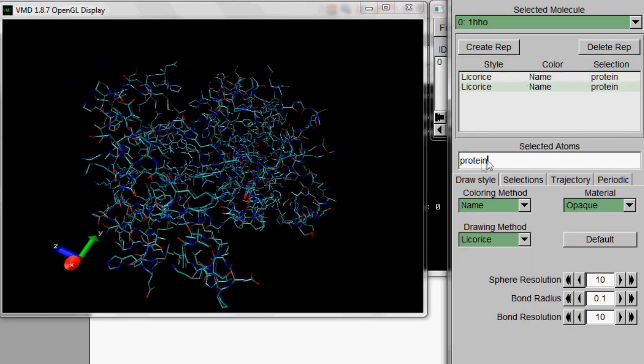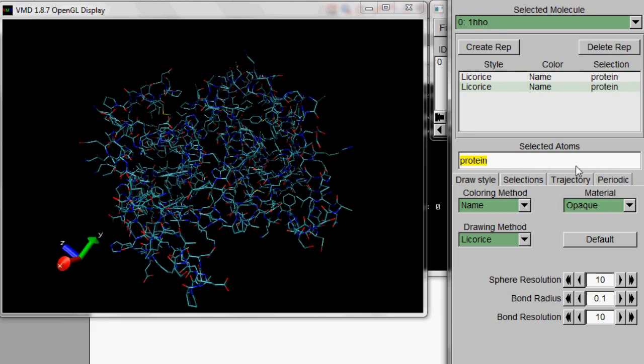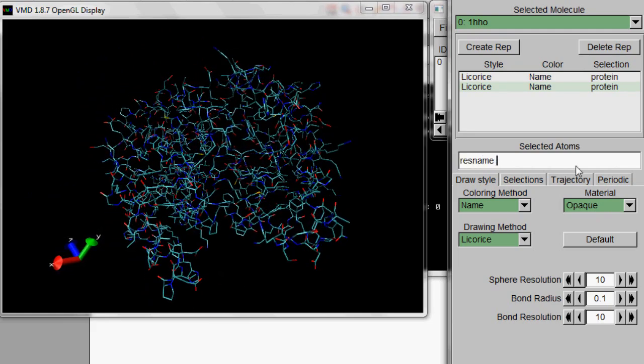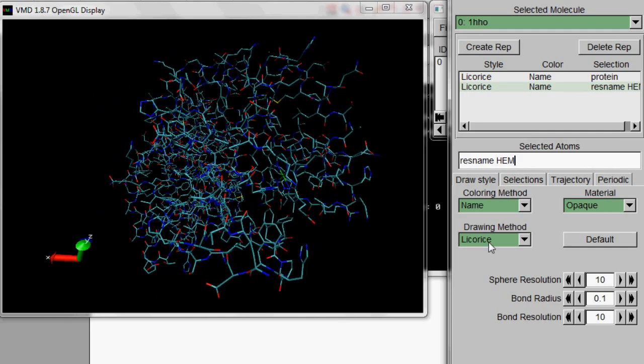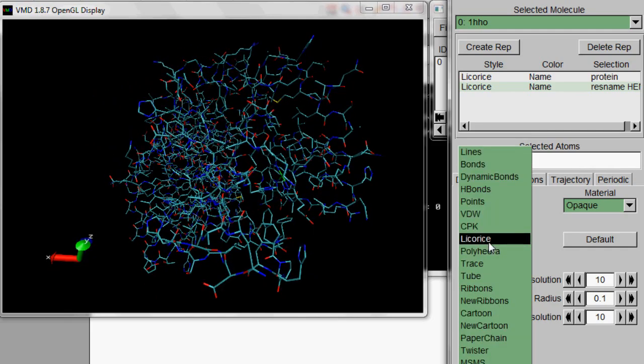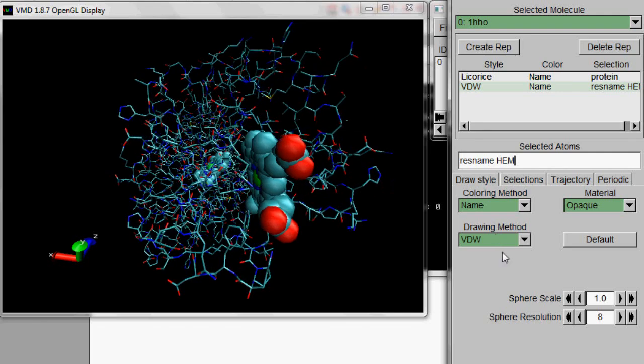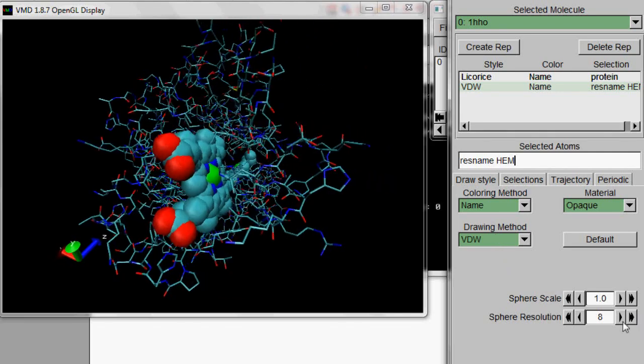So click on Create Rep. That's Create Representation. Now type in ResName Hem. And yeah, that's case sensitive. And change the draw method to VDW. That's Van der Waals. There you go. That's your heme.